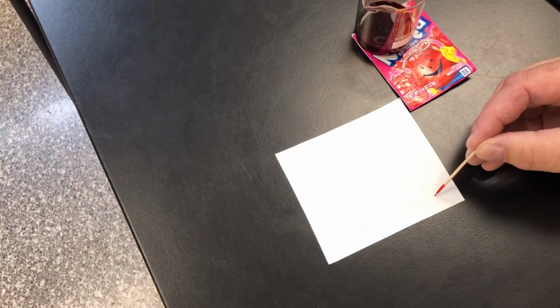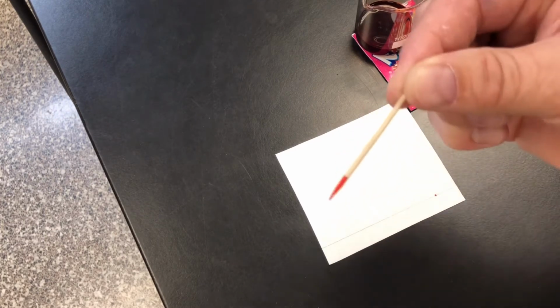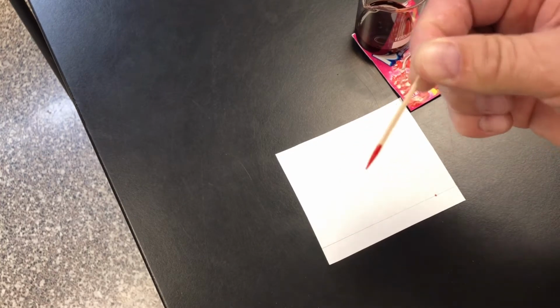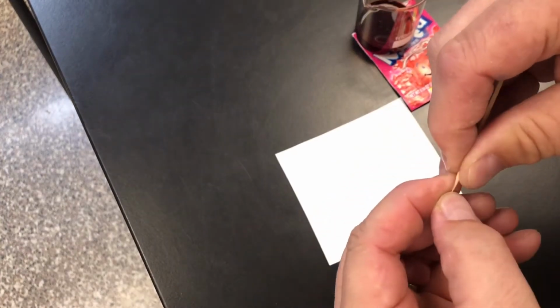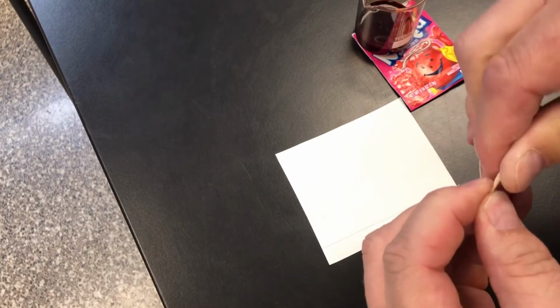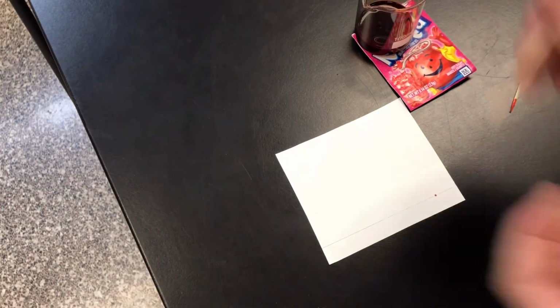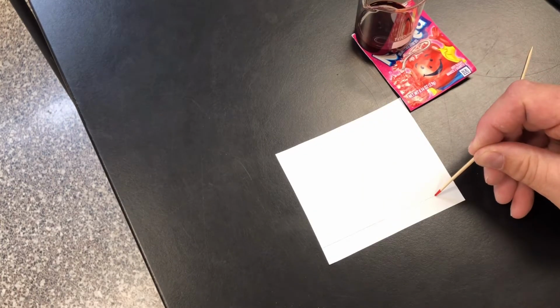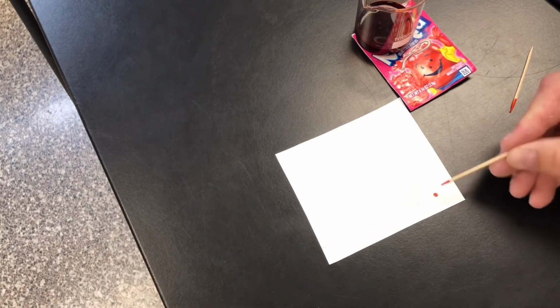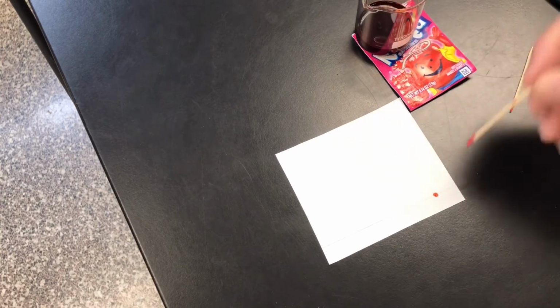We want to just barely touch the paper. And so one of the little tricks, if you'll notice, I did not do anything to this toothpick. One of the things we can do is to take this toothpick and just barely break the end of it off, and it makes it a lot larger surface area, and it kind of gives some fibers there that will act more as a paintbrush. And so now we can dot with it just a little bit more, but you don't want that dot to be much bigger than that, about half the size of a pea.